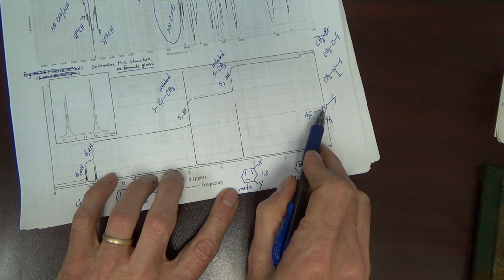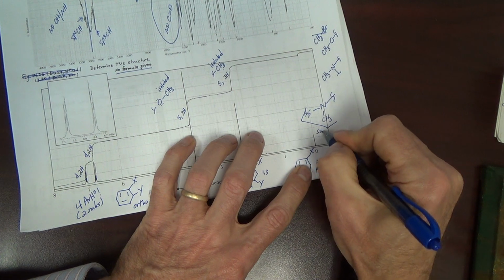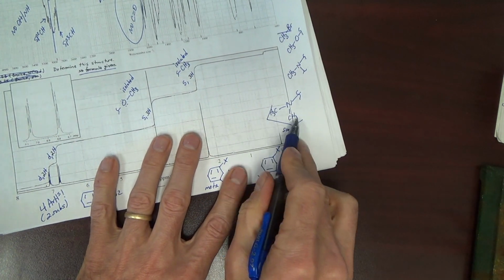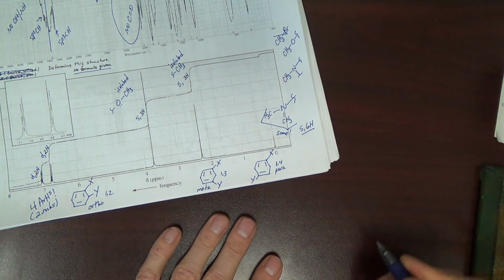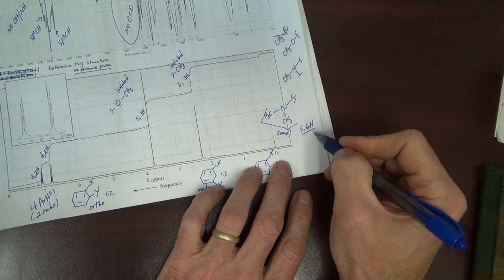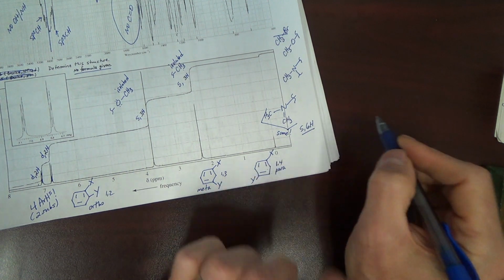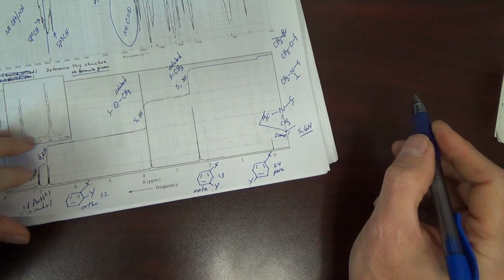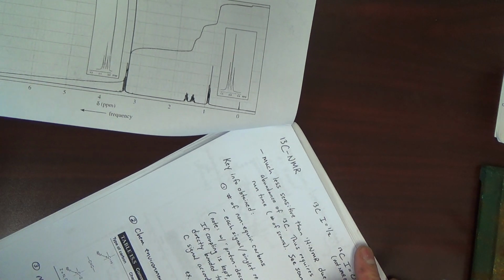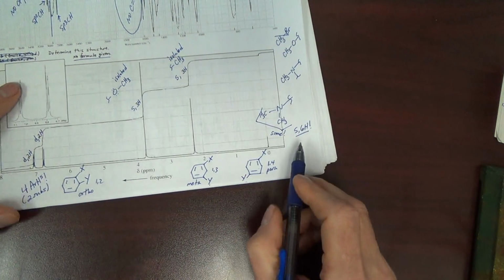The other thing is, if the nitrogen had two methyls, these are identical. That's just going to give one signal. That'll be a singlet 6H. All right, because of symmetry. All 6 of these H's are the same. That's one signal. We'll talk more about that. In fact, maybe the next NMR brings in the idea of symmetry there. We don't have a signal for 6H.